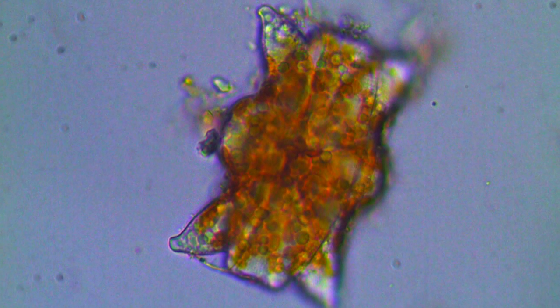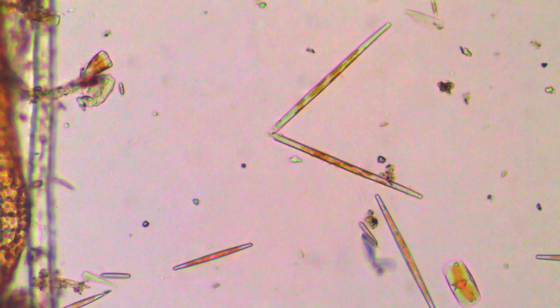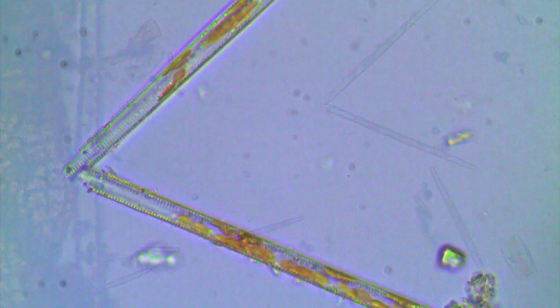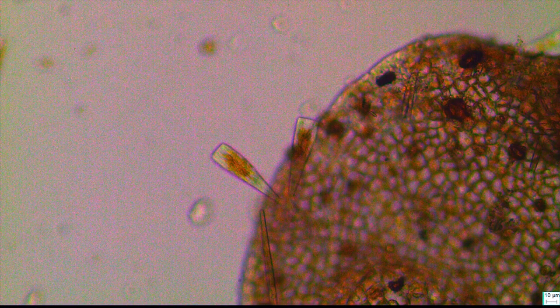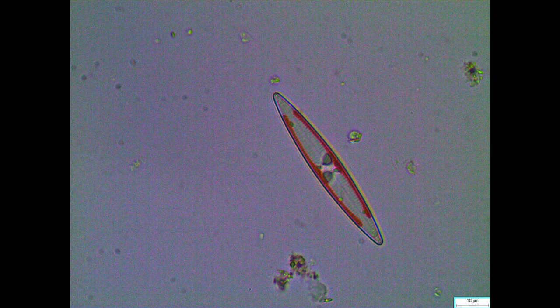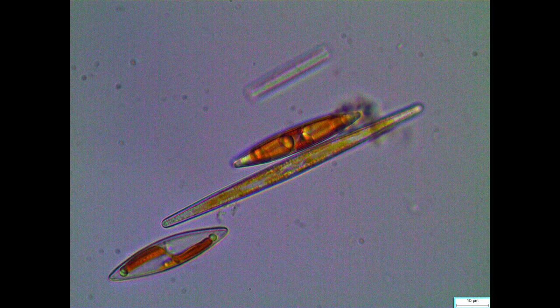The most common and problematic contaminant in seaweed culture are single-celled microalgae called diatoms. Diatoms can exist as single cells, colonies, or filaments. They are able to rapidly proliferate through both asexual and sexual means and tend to smother all available surfaces. They are very likely to be introduced into cultures through natural seawater or on plants collected from the wild. Diatoms can be controlled in cultures with the addition of germanium dioxide, a compound that inhibits the formation of the cell wall.